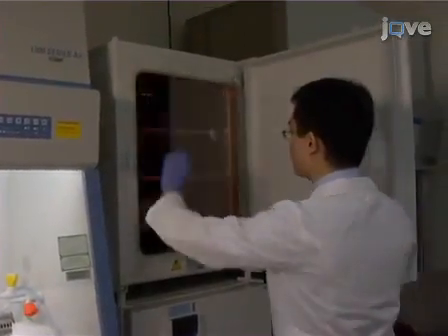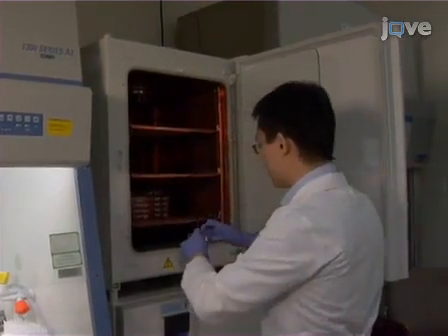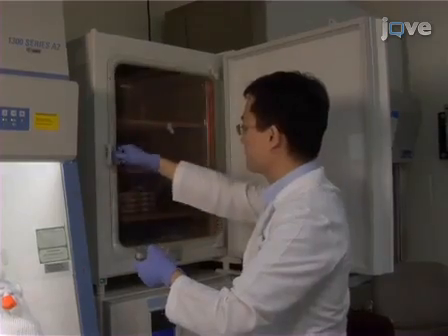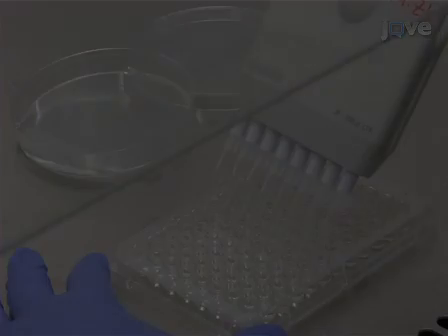Prior to the start of this protocol, grow HEK293 cells stably transfected with TRPA1 to a density of 70 to 90% as described in the written protocol. To begin cell preparation for the calcium assay, coat 96-well plates.